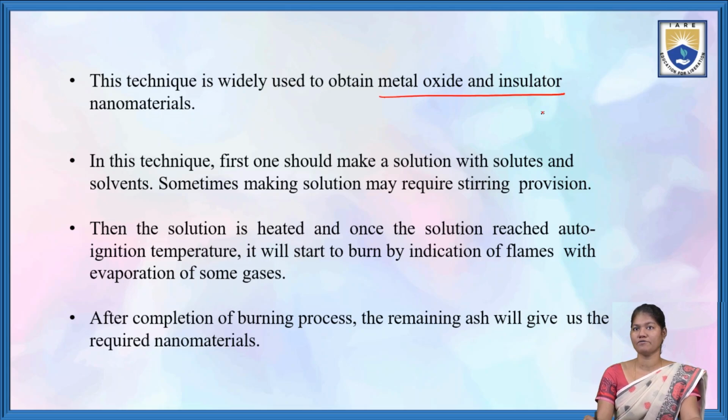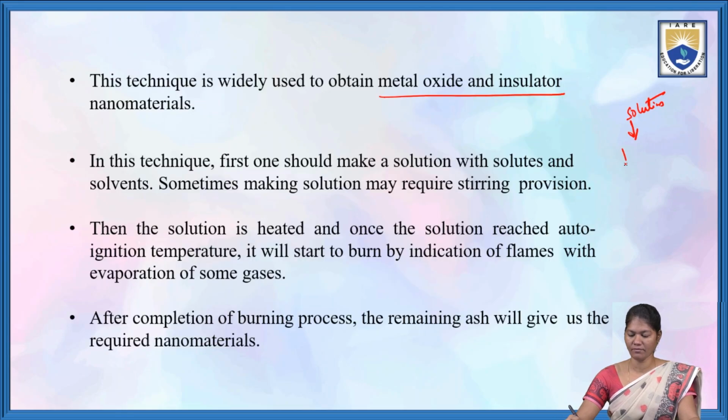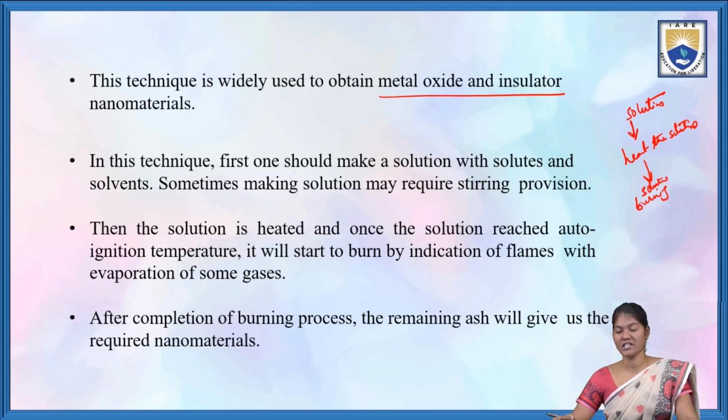In this technique, first we should make a solution and then heat the solution. When heating this solution, it will start burning. When it starts burning, flames will come out and some gases evaporate.